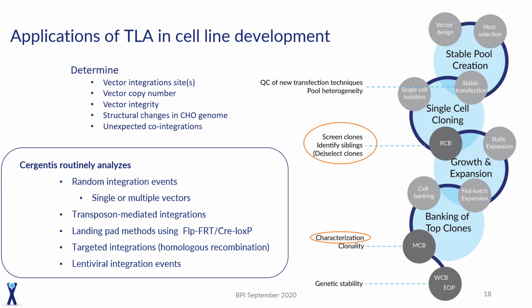whereby it's not uncommon to see incomplete recombinations and sort of downstream integrations into the landing pads, which will of course be very hard to resolve with, for example, FISH, which is something we have a lot of experience with.